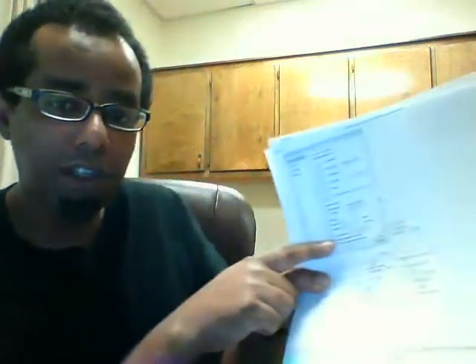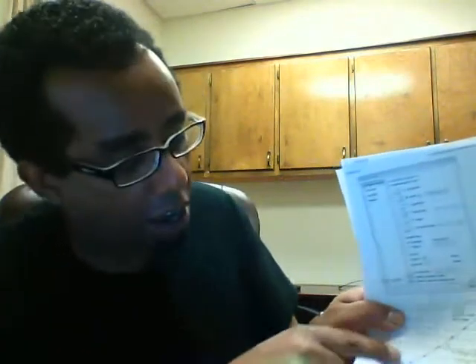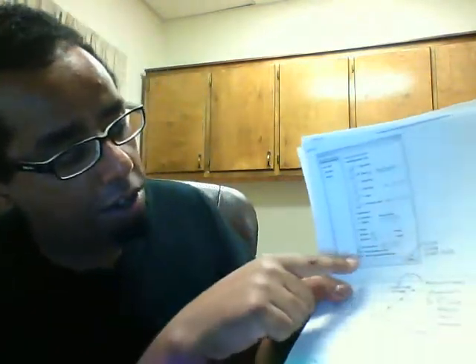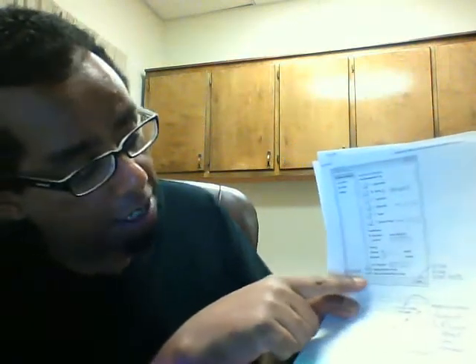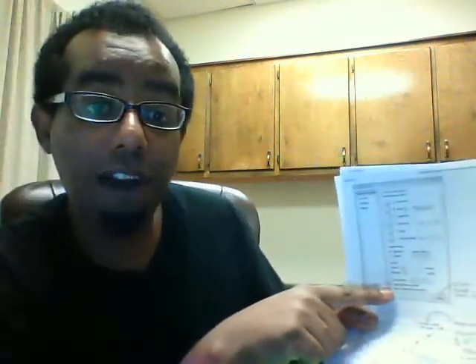Click on the box. I'm having some difficulty with the orientation. We get used to it. Okay, so you're going to display equation. Click that one, and then display the R squared value. The R squared value is going to tell you how precise you are. So it should be 0.9 to 1.